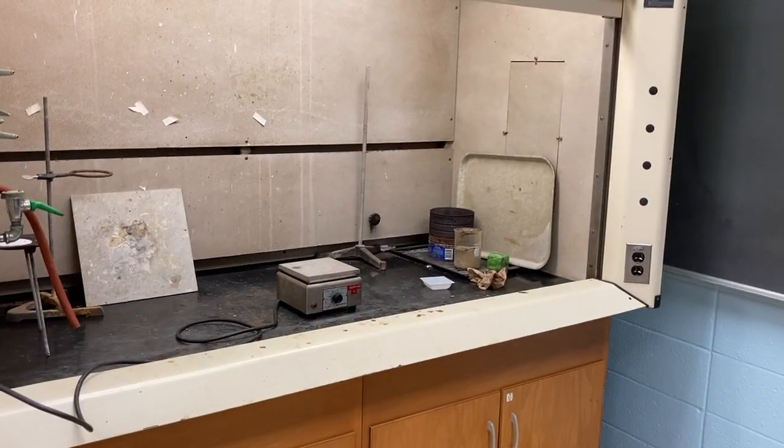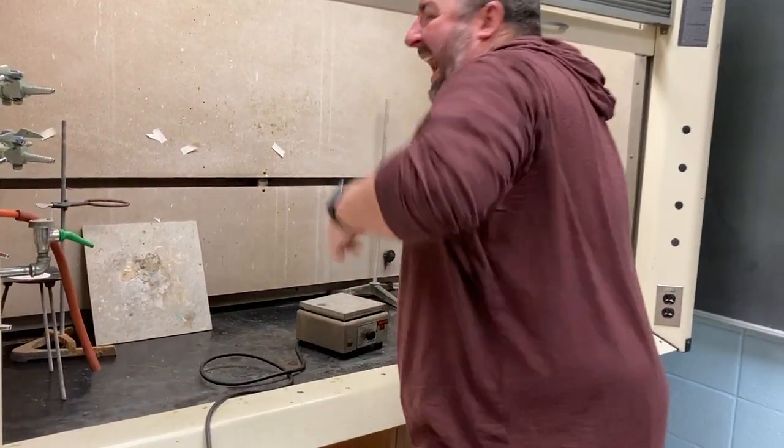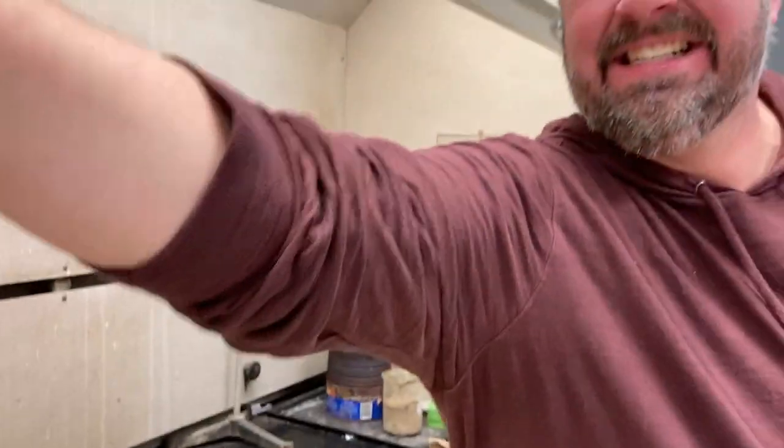All right. Okay, so I think we're done, right? I think we're done. All right, I'll clean up here. Ow! Gee! Woo! Are you okay? It's hot. The hot plate's hot. Go figure. Ouch.